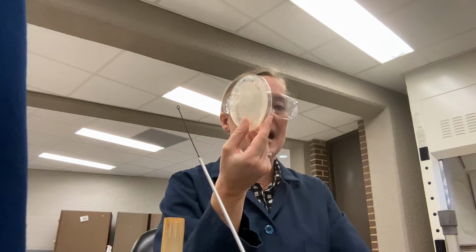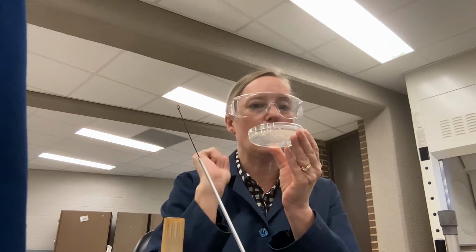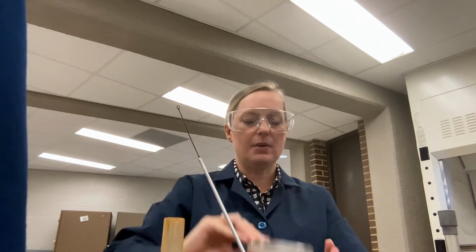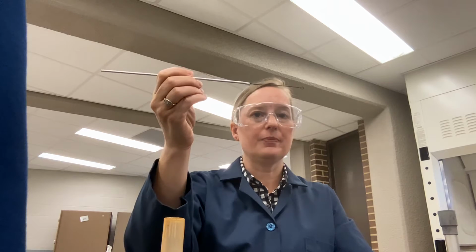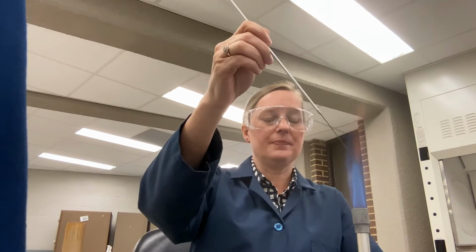So we labeled the bottom, but now we want to make sure that the lid is on top, because we're going to add the bacteria to the agar and not to the lid. So I'm going to put it on the table with the bottom down, and we're going to flame our loop. This is called an inoculating loop. It has a circle on the end with a braided region. And here off to the side, we have our flame.